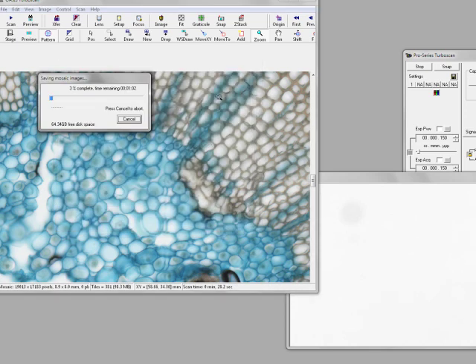And that's going to allow me to keep this massive large view that I want to do, this larger than the RAM of the computer view, and allow me to move around freely by paging memory around. So that's one area. I can then take this, and actually you can go to the Objective Imaging website and you can download a free viewer that you can put anywhere to repeat and look at this image later on.